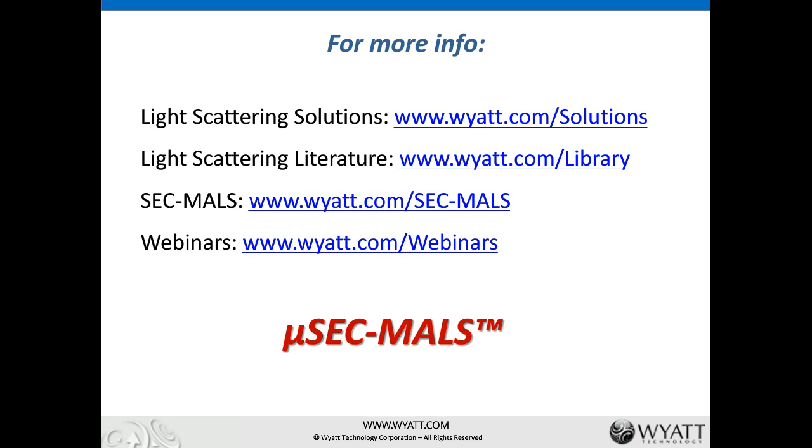Sure. So that's when you have two different concentration detectors, and their response factors are actually different. For example, for UV, in this case, it's looking at the aromatic residues of the proteins, that is, the tyrosine, the tryptophan, and the cysteine, I think. So that's the extinction coefficient.